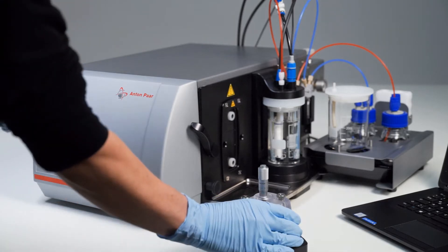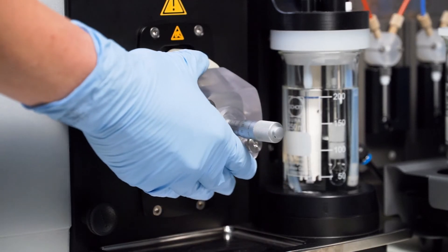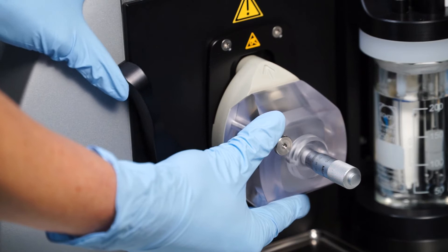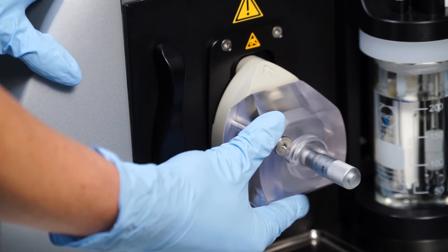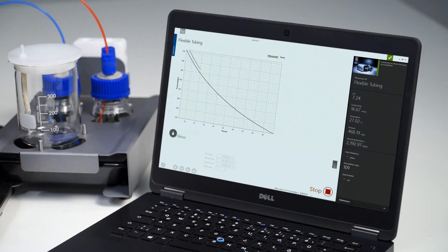Now mount the measuring cell on the instrument. Simply plug in the cell and lock it by turning the lever upright. The flexible tubing cell is then recognized by the Surpass 3 software.